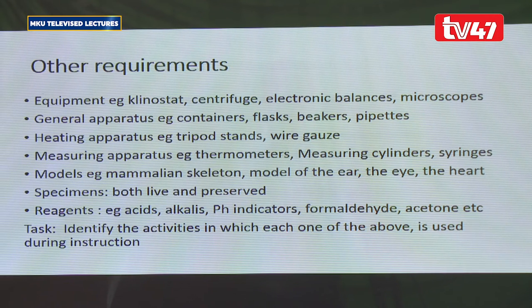Then we have also the general apparatus, like the flasks, the conical flasks, the round-bottomed flasks, beakers, pipettes, and so on. Heating apparatus, tripod stand, wire gauze, Bunsen burner, measuring apparatus like the thermometers, the measuring cylinders, syringes.